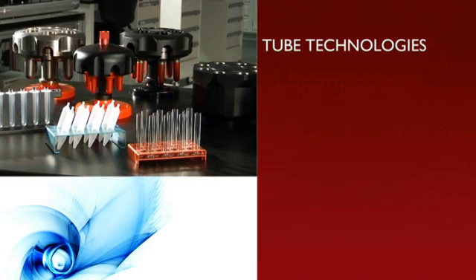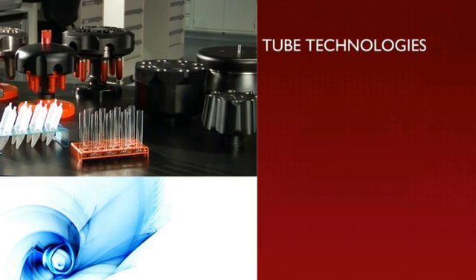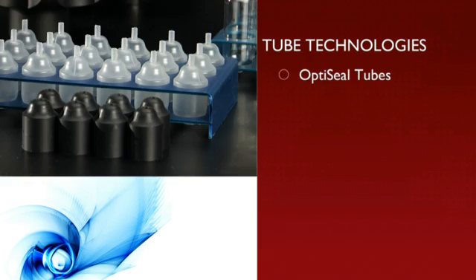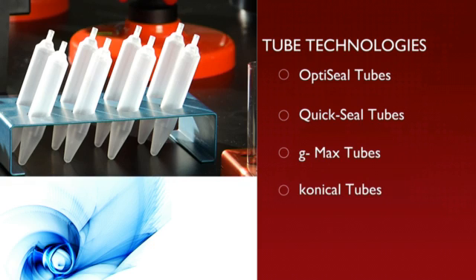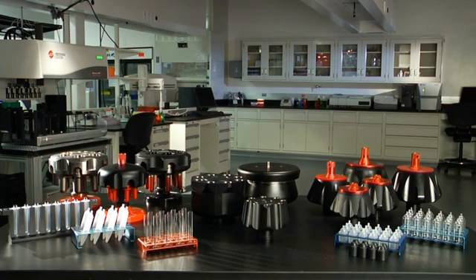Our exclusive tube technologies, in particular, offer targeted solutions to your unique needs. They include OptiSeal Tubes, QuickSeal Tubes, G-Max Tubes, Conical Tubes and our UltraClear Tubes.